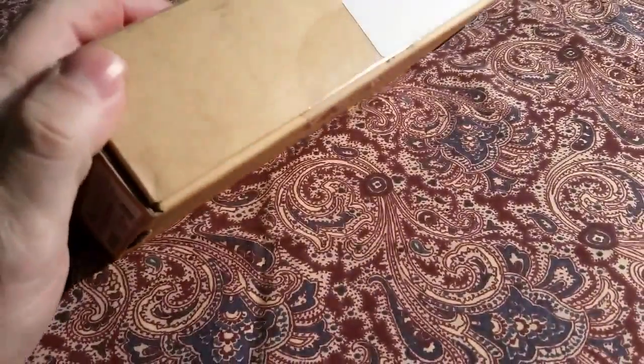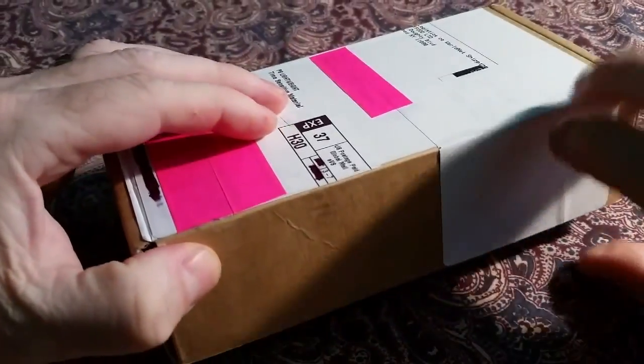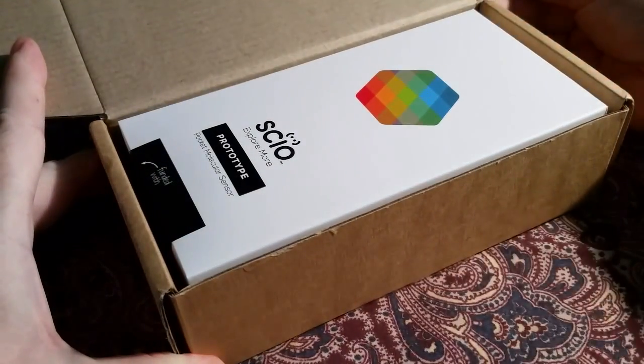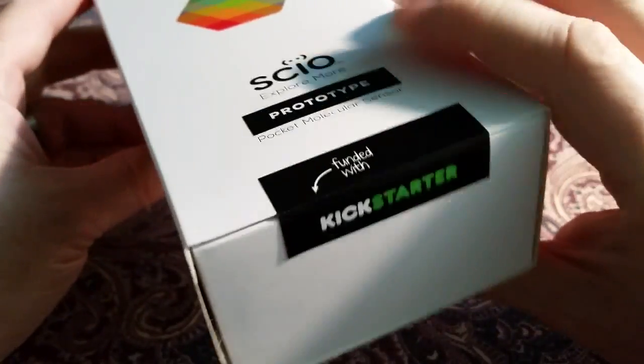Here's the in-package label. We'll cut it open and see what's inside. Inside the shipping box is the SIO retail box. Here's the SIO box and its label — looks like a similar label. We have an FCC approval number, branding, and it's marked as funded with Kickstarter.